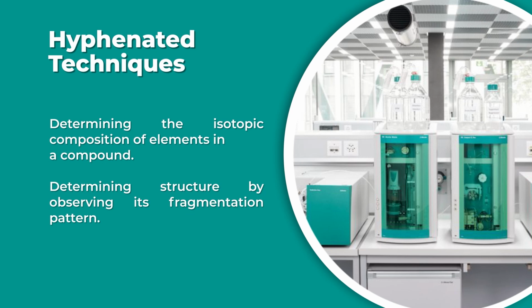How do we do the structure? First fragmentation will give us the mass. Those fragments we can further fragment. We can have mass, like GC-MS, LC-MS. When I say first mass, that means fragment, mass by charge ratio, I do it. And for each fragment, it is possible to fragment it further.